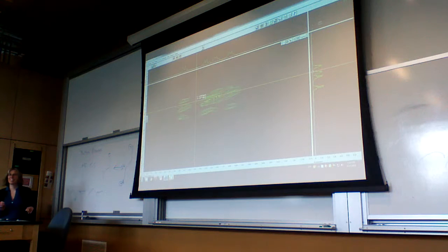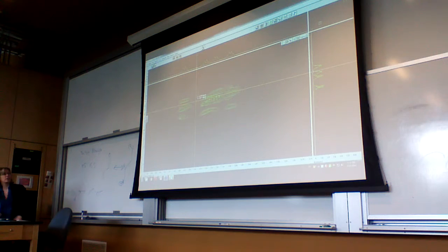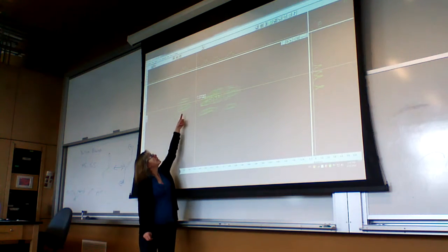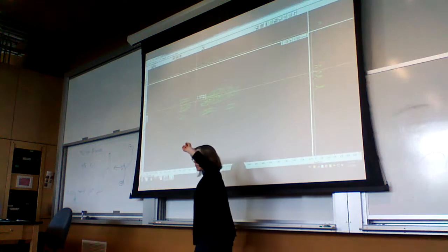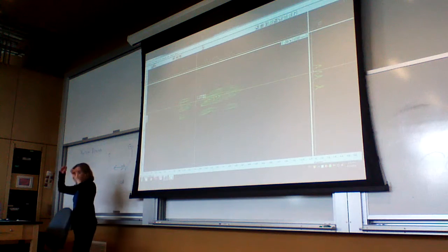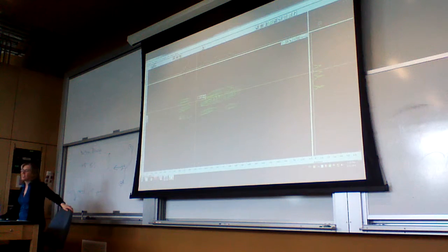But there's no peak there. Well, but it's lining up, if you look here, that's that peak coupling with that peak. Because it's split into a doublet, you see the doublets in the signal here, if you have a really good signal. So what exactly are we getting from this?